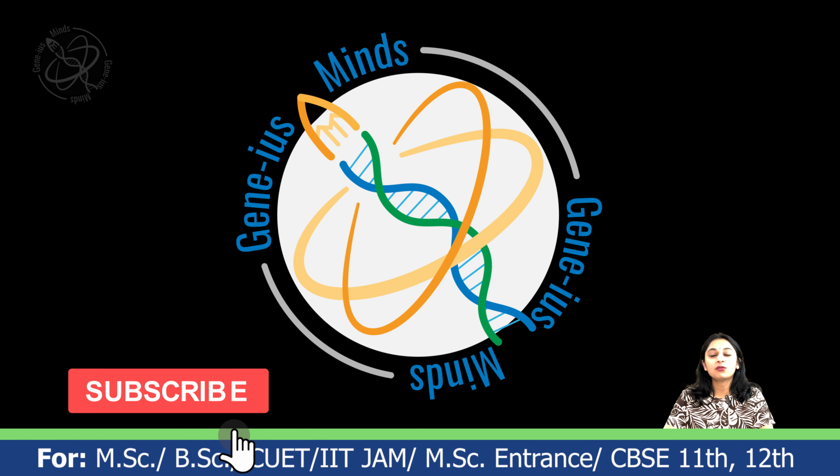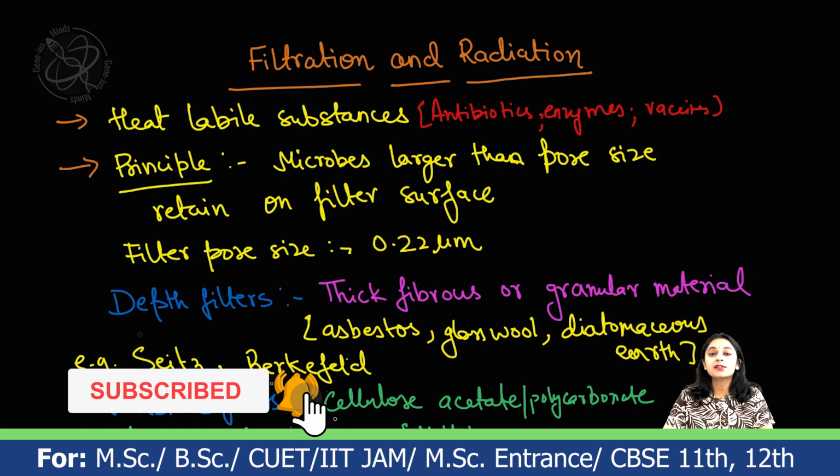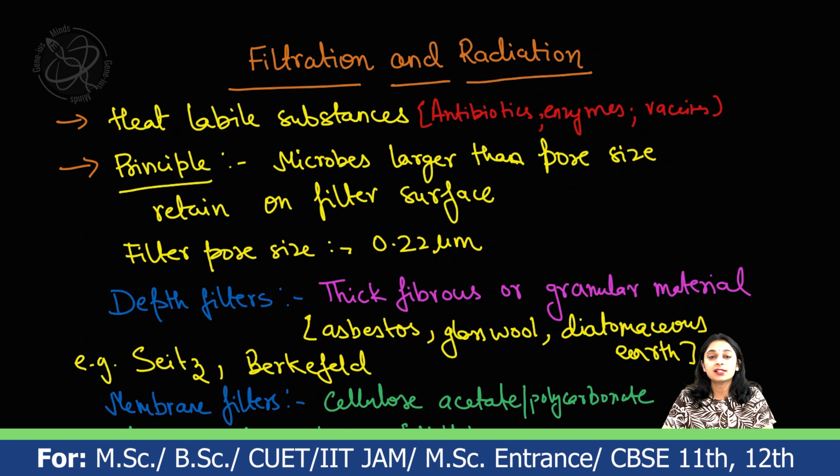In today's video, we are going to learn how we use filtration and radiation methods for the sterilization process. In the last video, we discussed heat as a sterilizing agent. But some compounds are heat sensitive, they are heat labile, they cannot bear heat. There, filtration and radiation methods play an important role. Let us first discuss the filtration method.